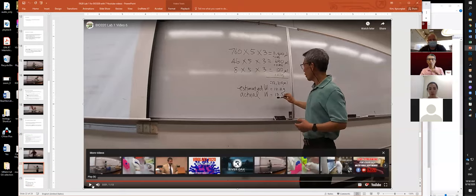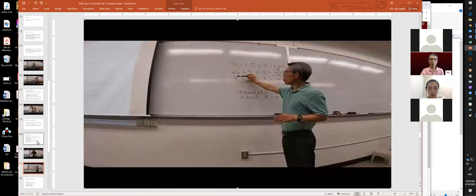So your estimated value is 12.21 grams. Your actual value is 13.5 grams. So let's calculate this. The actual value subtracted by the estimated value gives you nearly 1.3, right? So 1.3 will be divided by your estimated value, which is 12.21. So what will be the answer? 1.3 divided by 12.21. Anybody have a calculator? It's 10.6%. So that's actually what really happened here.